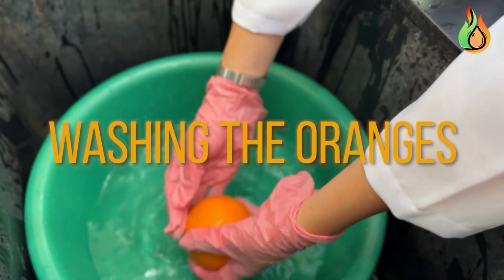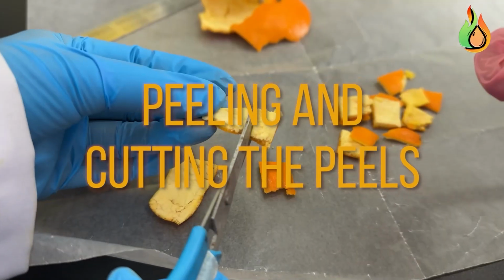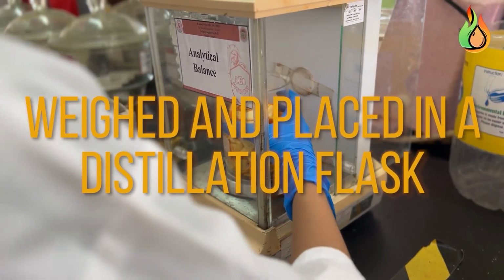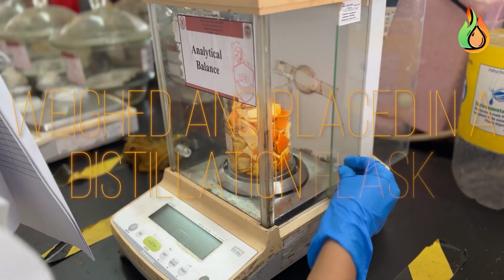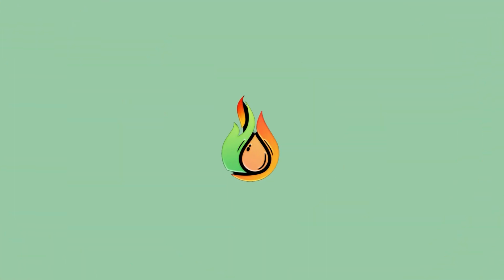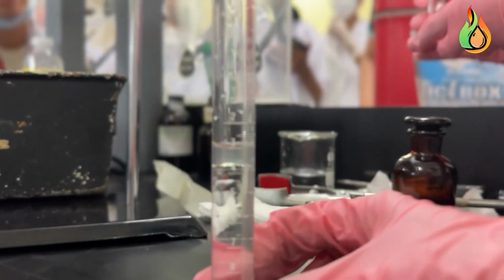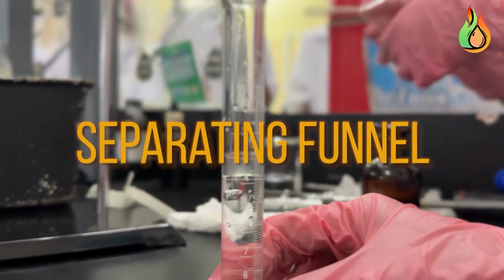To extract essential oil from orange peels, the process begins with washing the oranges, followed by peeling and cutting the peels into small pieces. The peels are then weighed and placed in a distillation flask filled with distilled water. As the steam cools and condenses, it forms a mixture of hydrosol and essential oil, with the oil naturally separating due to its lower density. To isolate the oil, the mixture is transferred into a separating funnel where the hydrosol is carefully removed.